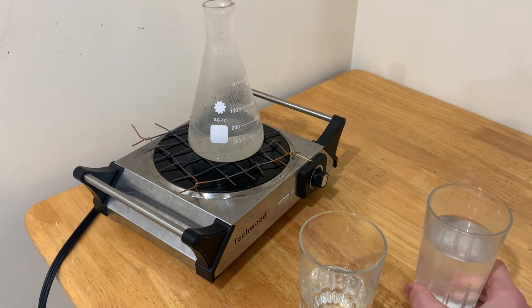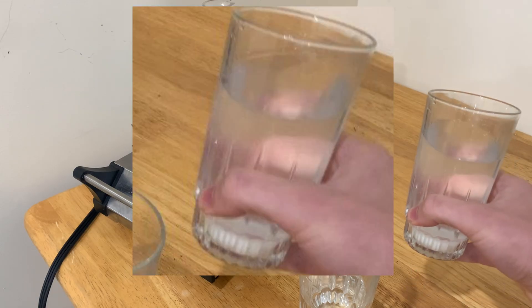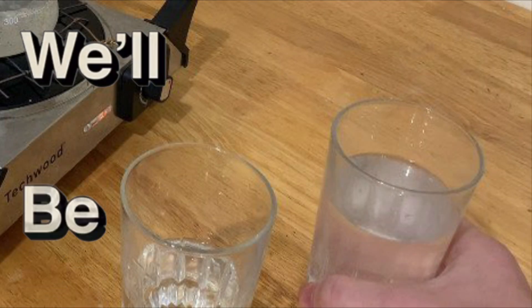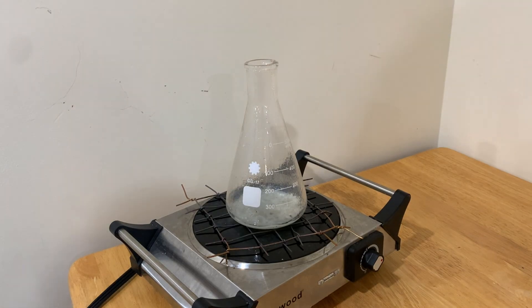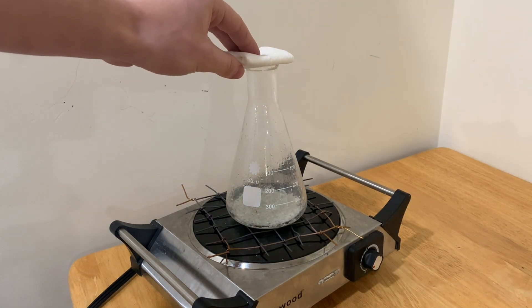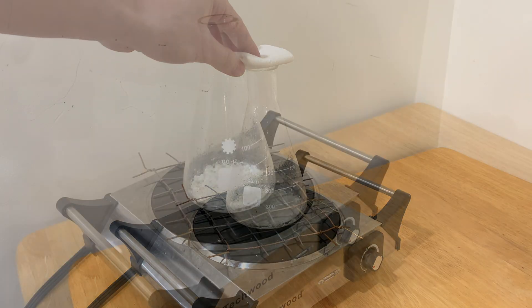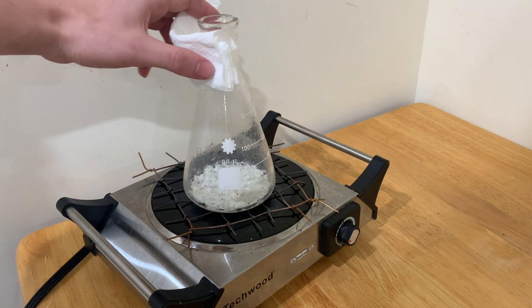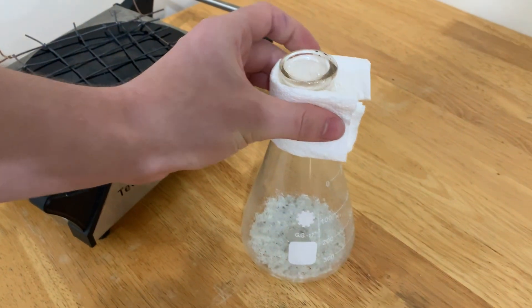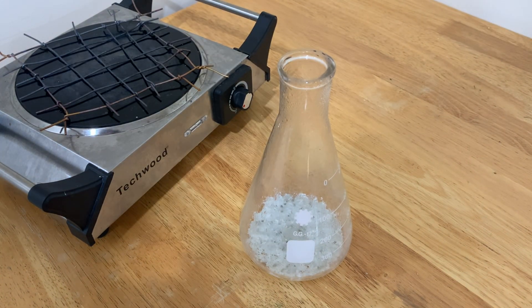My stomach is starting to feel weird now. Wait a second... Now that most of the water has been boiled off and it's making a popping noise, I'm going to decrease the heat to zero and cover it before hot sulfuric acid droplets get sprayed on my face. Now that there is barely any more liquid inside the flask, I'm going to set it aside and let it cool down until it is basically room temperature before I can do anything else with it.